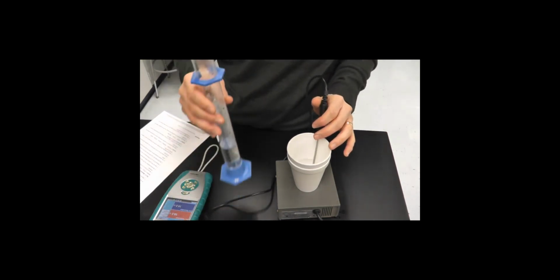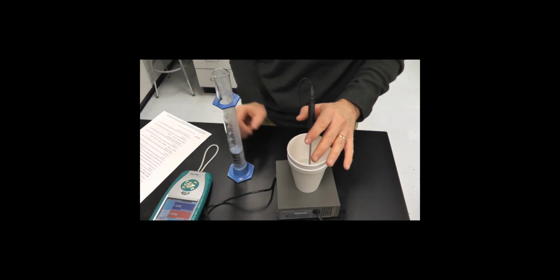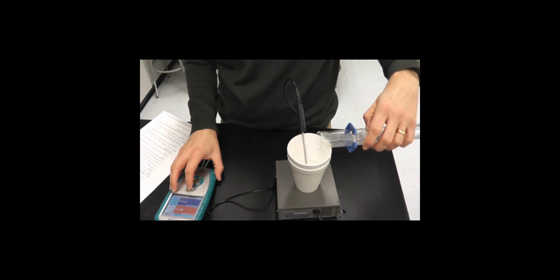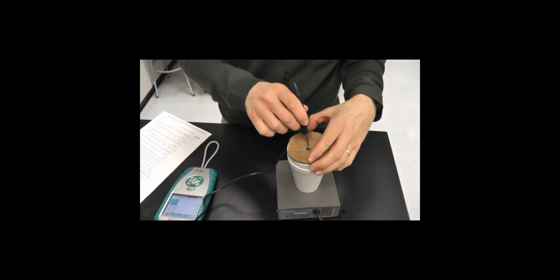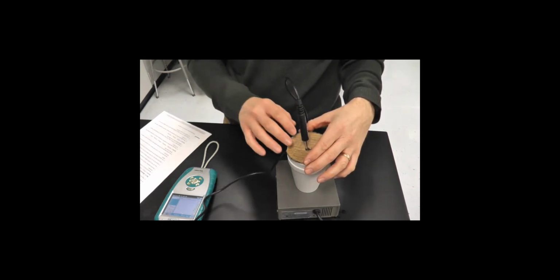All right, so here's where it's going to get tricky. I'm going to put this in here. I need several hands. I'm going to turn on my stir. And essentially, we're going to take the temperature every 20 seconds as soon as they mix. So here we go. Collect. Ideally, go like that.